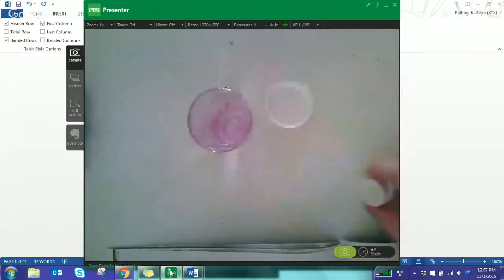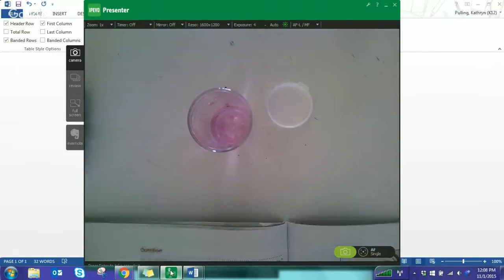All right, so I think in the end I might have added 8 or 9 drops, but just make sure that it's not going back to clear after it sits there for a second and the pink stays. Okay, so now on to step 3, add 1 drop of alkalinity titrant low, then swirl, observe for a change, and then add the next drop. All right, so we're going to keep doing this. We're going to add drops until we see this pink color disappear.